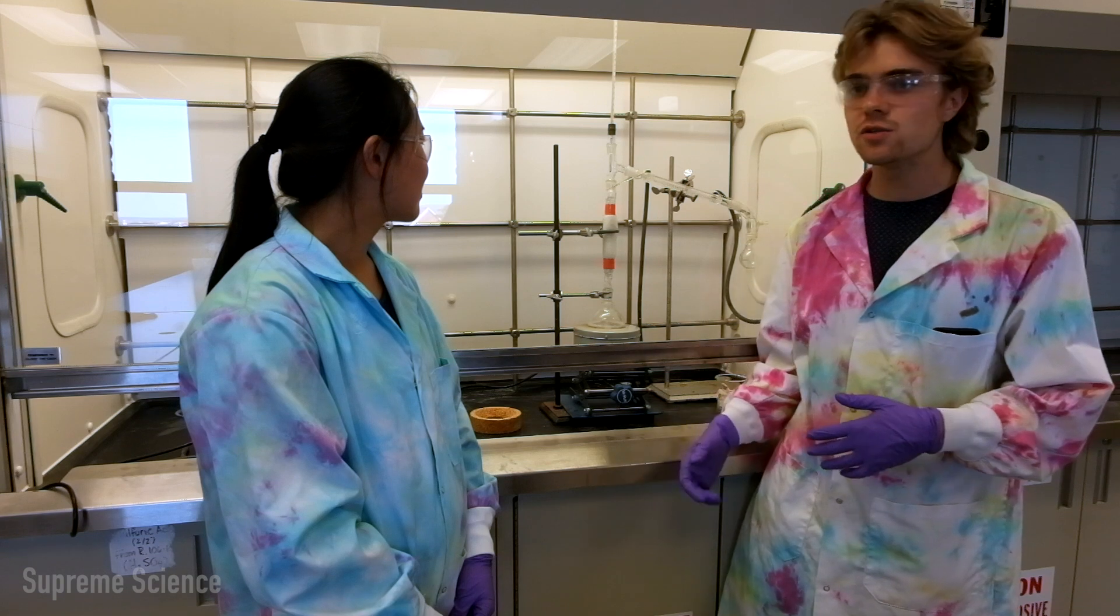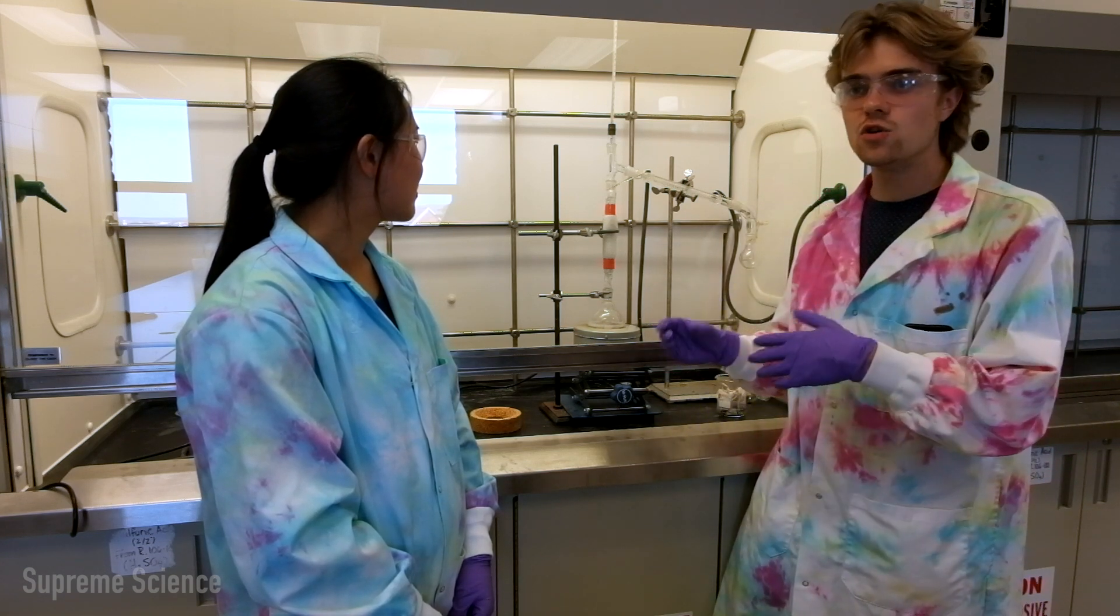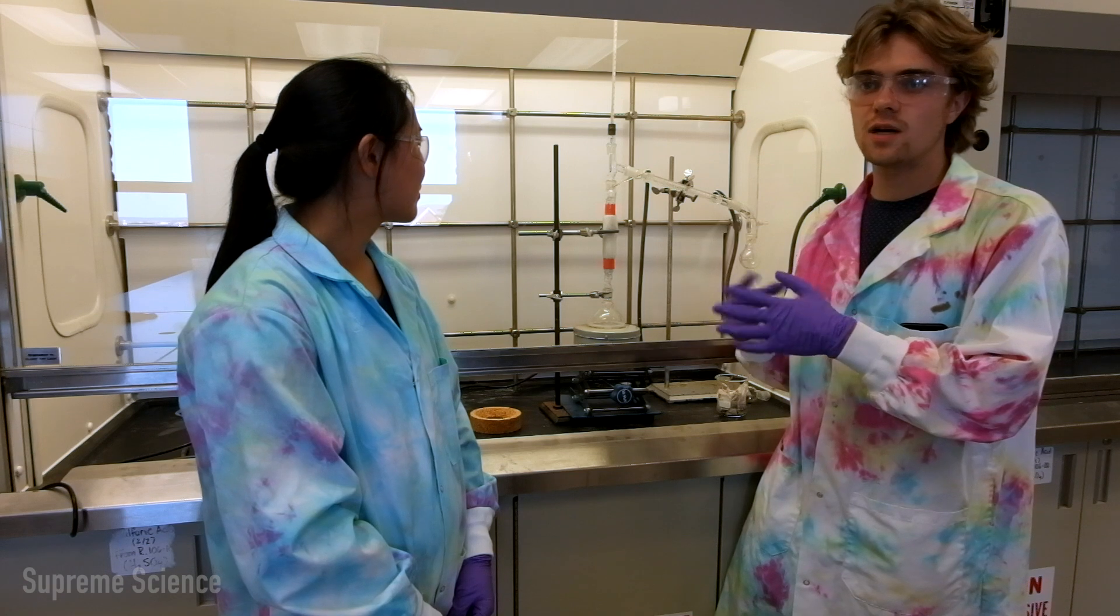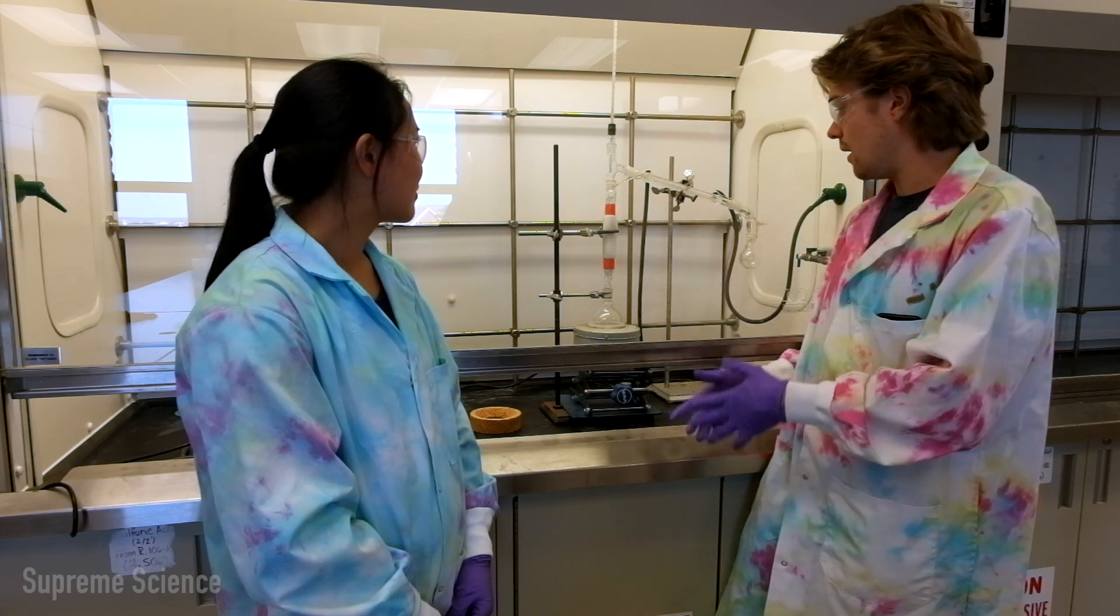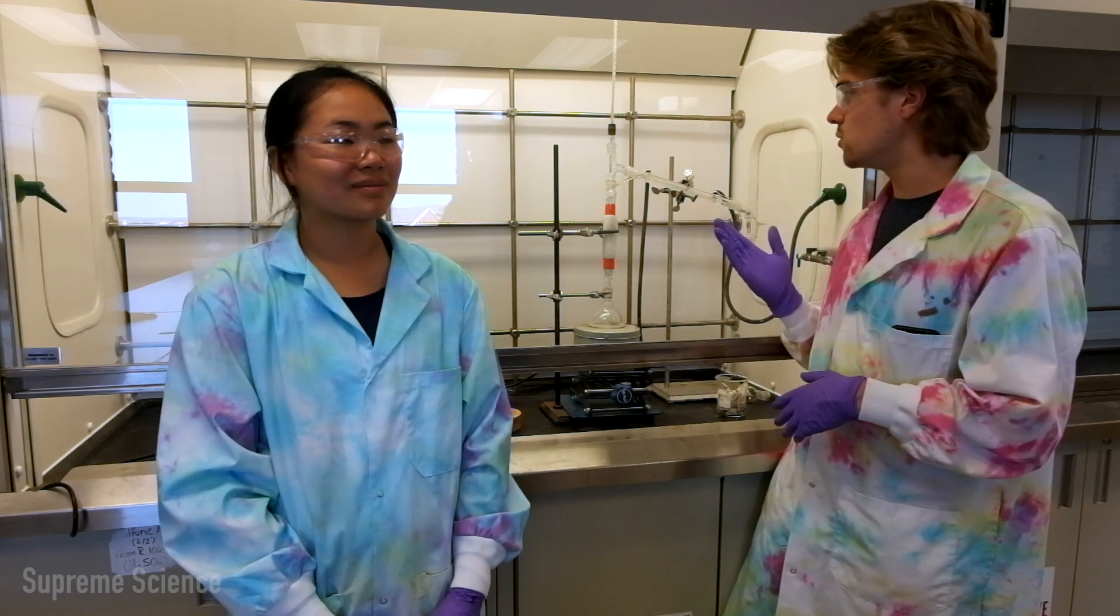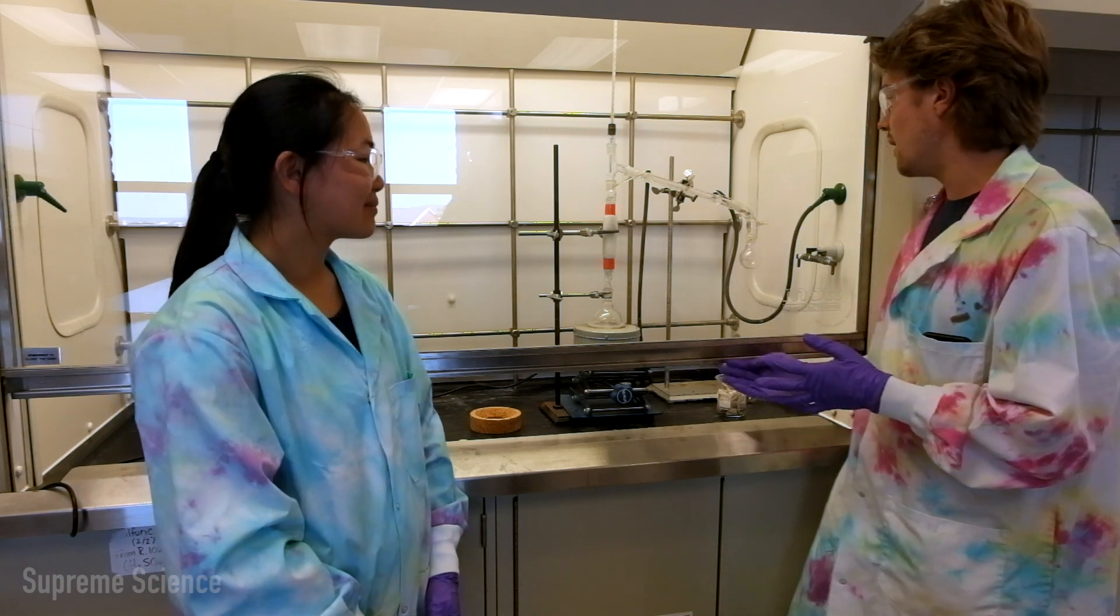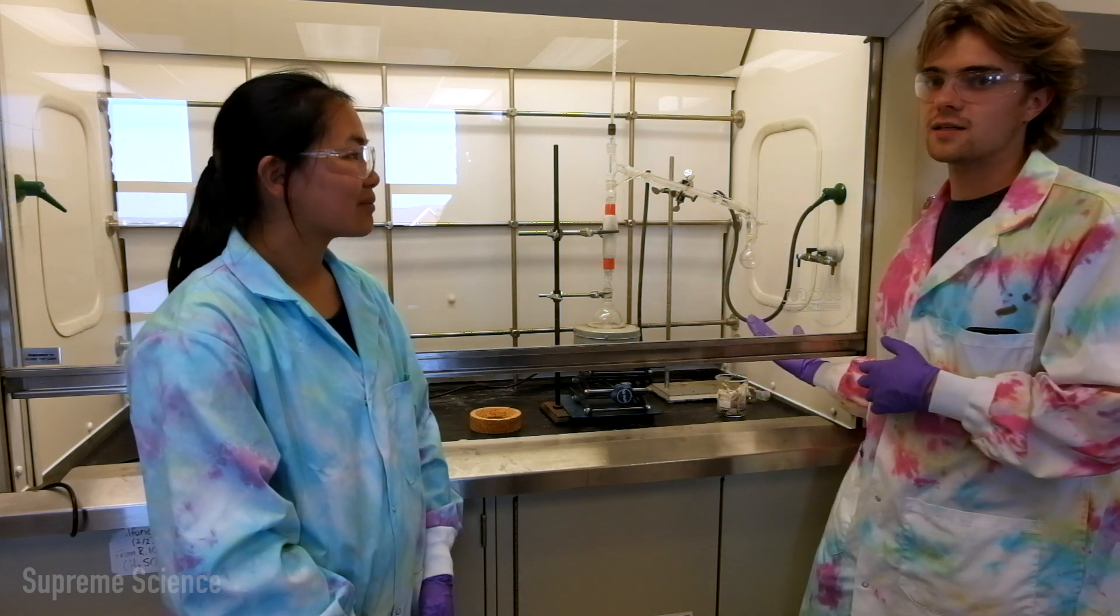And this process continues. So condensation occurs, the vapor mixes, new vapor mixes with the condensation to create a new vapor mixture, and then it evaporates further up the column. So when we reach the top of the column, the lower boiling point component is going to be the first to reach the top of the column and come down our condenser and end up in our receiving flask.